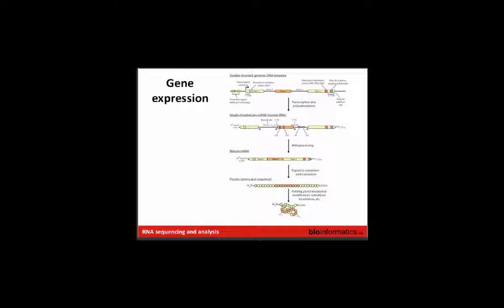But a lot of RNA-seq is focused on these mRNAs. But it's important to remember that we're never really actually sequencing these things exactly in RNA-seq. So we're converting RNA to cDNA. And then for most species, the typical length of a transcript is much larger than what can actually be sequenced by RNA-seq. So we're usually fragmenting cDNAs and actually sequencing little pieces of these things, and then trying to assemble or align them in such a way that we can infer what the full-length structure of each RNA looked like.